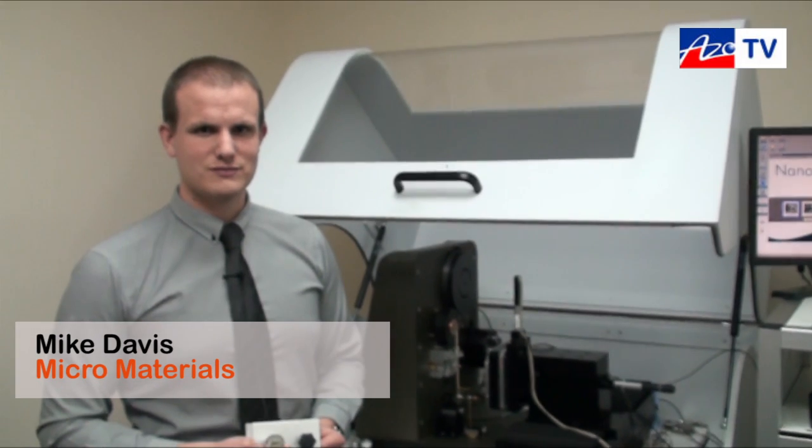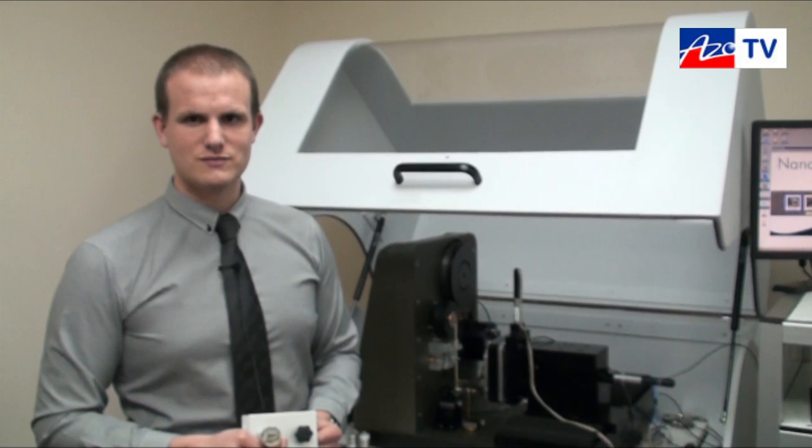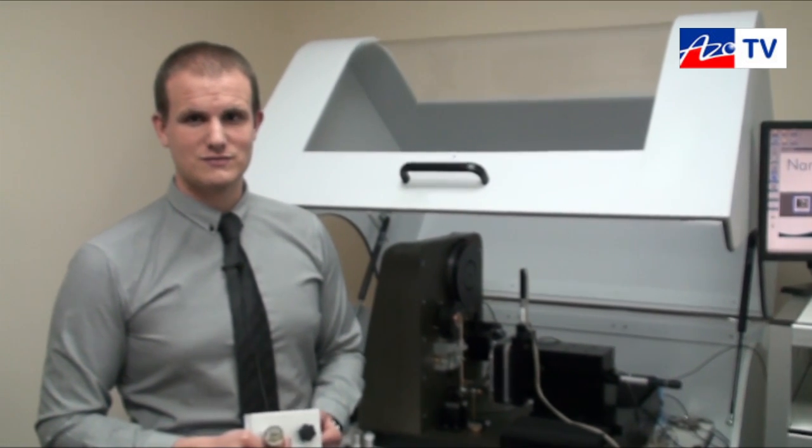This is Cameron Chai bringing another episode of AzoTV. Today we're on site at MicroMaterials and Mike Davis is going to give us a demonstration of how easy it is to use the NanoTest Vantage system.